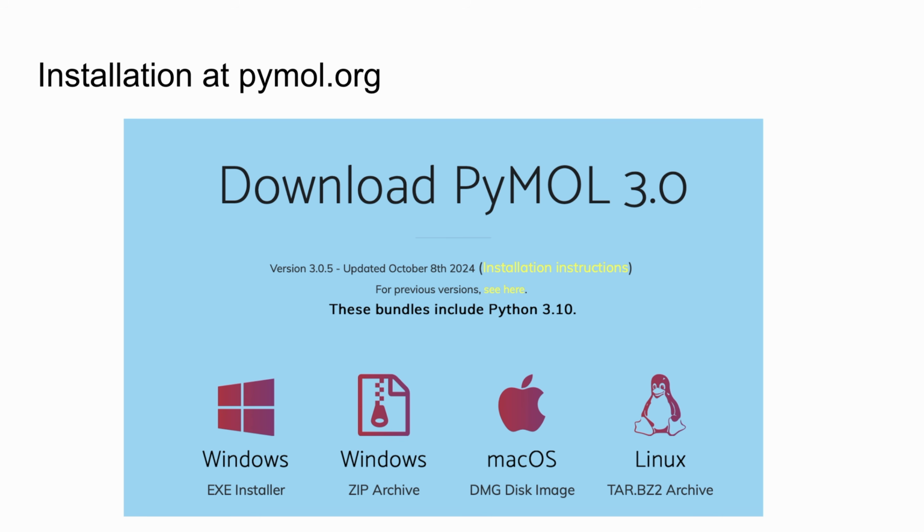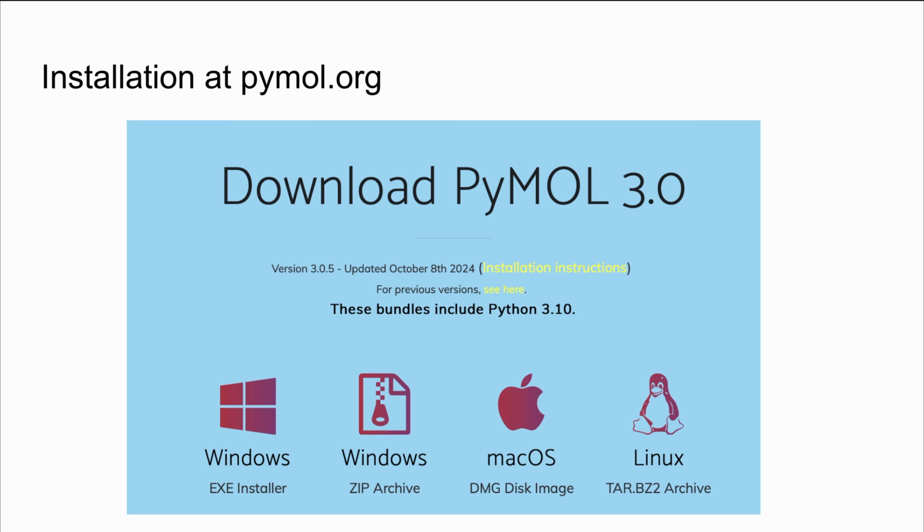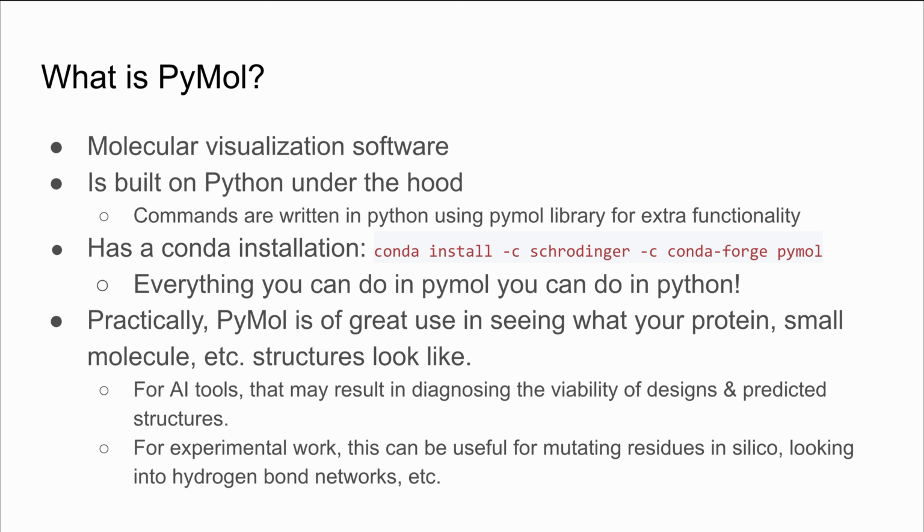So you all should have done in homework 1, I believe, it might have been 2, which is install PyMOL. That was the first thing that I had you guys do, which is install PyMOL in VS Code. There was a little basic homework just to ensure that you had it installed. But in case you don't, you're welcome to do the homework really quickly right now. PyMOL installs really fast. It's very small, but hopefully you guys all have it.